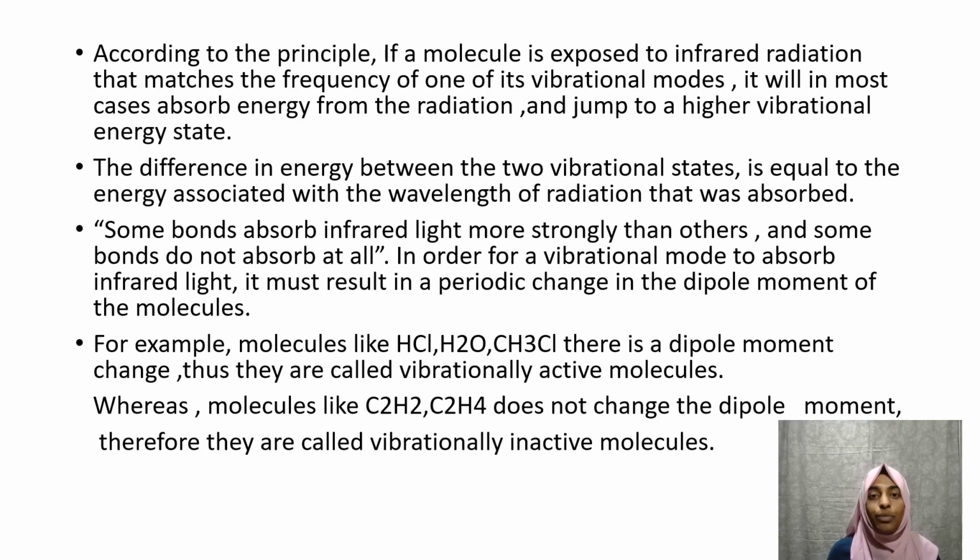According to the principle of IR spectroscopy, if a molecule is exposed to infrared radiation that matches the frequency of one of its vibrational modes, it will in most cases absorb energy from the radiation and jump into a higher vibrational energy state.